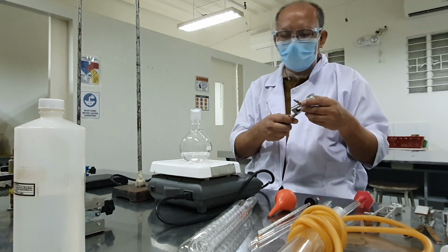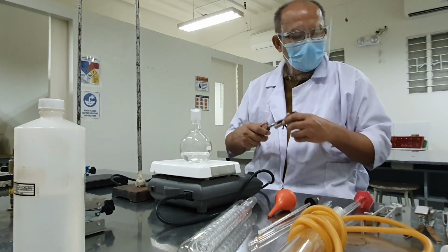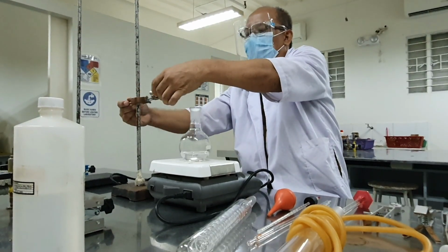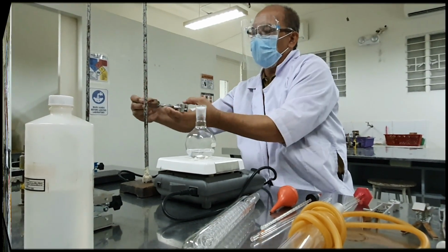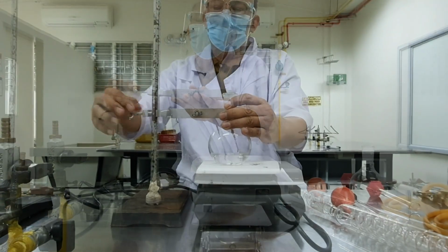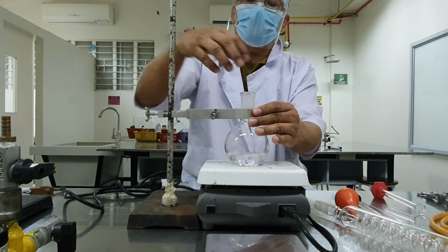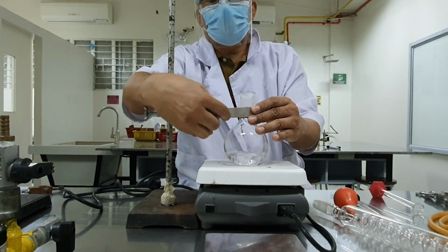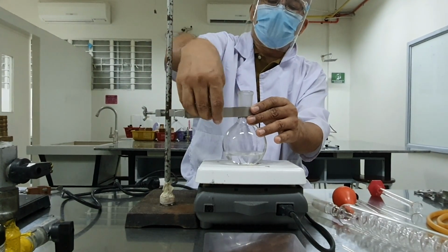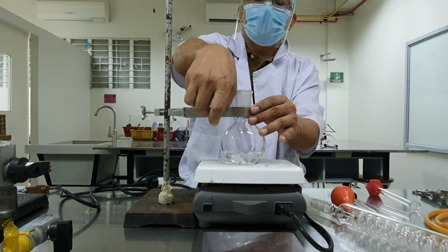And then we are now ready to connect our condenser. But before we do that, we have to attach this one first, something to hold. See to it that you tighten the flask, to avoid it easily breaking if there is a sudden explosion.